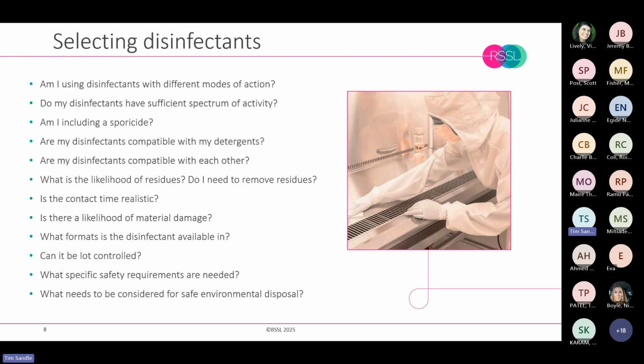So before undertaking qualification, we need to make sure that we're using the right disinfectants as required by the end user. So there's no point going through a lengthy and often relatively expensive qualification process if we're going to end up with products that are not user suitable.